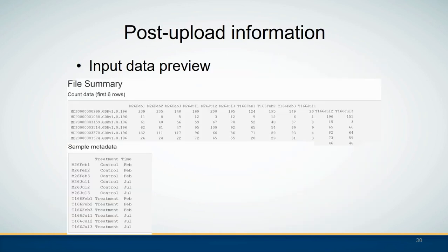After uploading the dataset to IRIS, users can preview the input data from the right panel of the website. Under file summary, the count data lists the count matrix with rows representing genes and columns representing sample IDs.